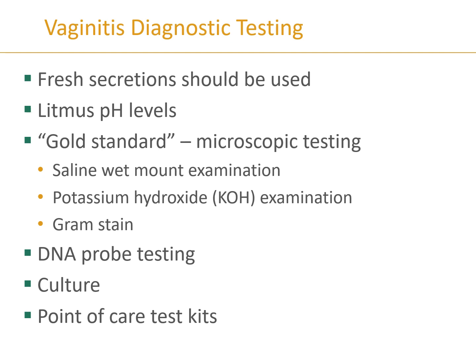So the physician or provider, when they're actually collecting those specimens, they will do it while they're doing a pelvic exam. And while they're doing that pelvic exam, they will also go ahead and test the pH. Usually it's some sort of pH paper that they use to do that testing. And then after that, you would do the saline wet mount prep, possibly a KOH prep, and then a gram stain. So depending on where it's being tested, usually like your OBGYN or your physician's offices, they'll probably do the saline wet prep and the KOH.